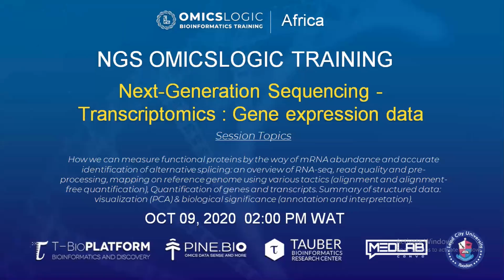The next session will be focused on next generation sequencing, transcriptomics, and gene expression data. Here we will learn how we can measure the functional proteins by way of mRNA abundance and accurate identification of alternative splicing. We will cover an overview of RNA-seq, read quality and pre-processing, mapping on a reference genome using various tactics and logics, alignment and alignment-free quantification, and how we can quantify the genes and the transcripts in a particular data set.